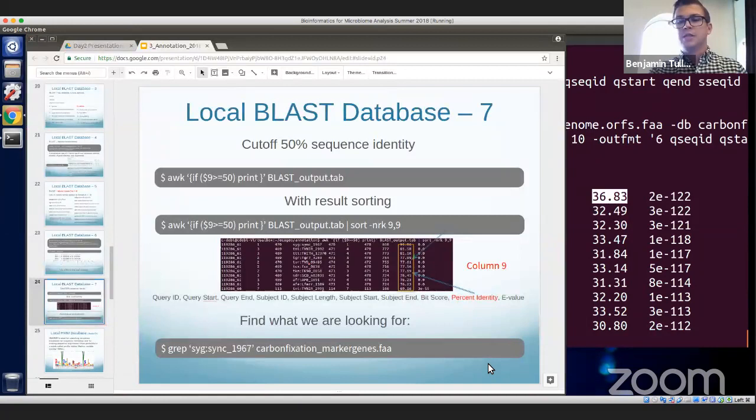This is one of those things where I used to do this the hard way for a really long period of time. Then the person who we asked to do this part of the workshop for EcoGeo was like, why don't you just use the command line to solve this? If you want people to find where everything's greater than 50%, just have them do that. I was like, great, show me how to do that. We're going to use a command that we didn't really talk about yesterday in the Unix portion, but it's called awk.